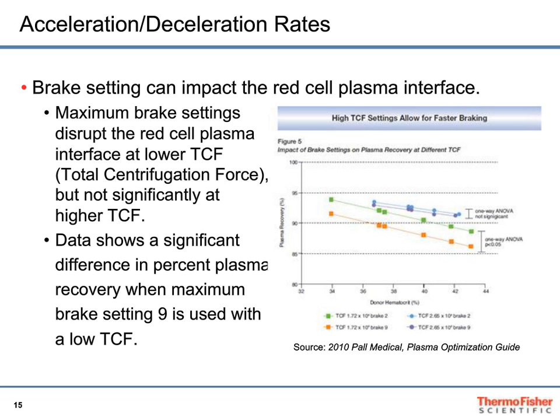You can take some data, and you can identify what's the best accel curve or your decel brake setting, these types of things that give you the best result on the front and the back. And honestly, I would say probably 80 to 90% of that work is done on the decel, but I have seen some accel problems too, so we always ask both ways. Let's talk through that and make sure that you're getting the best possible result.